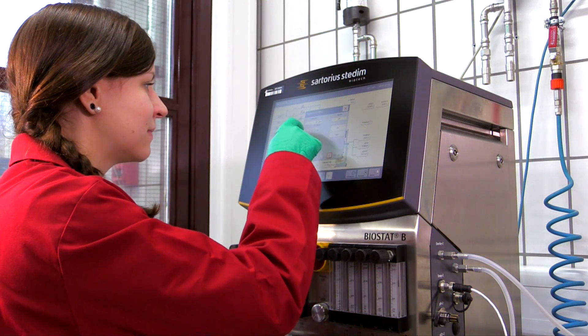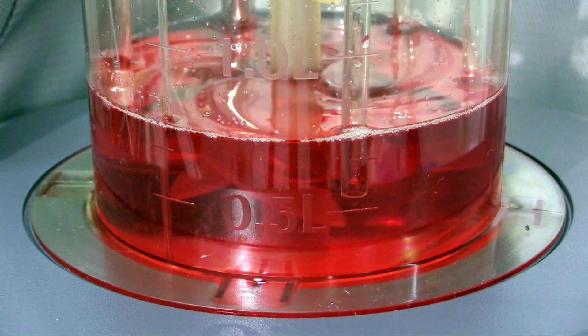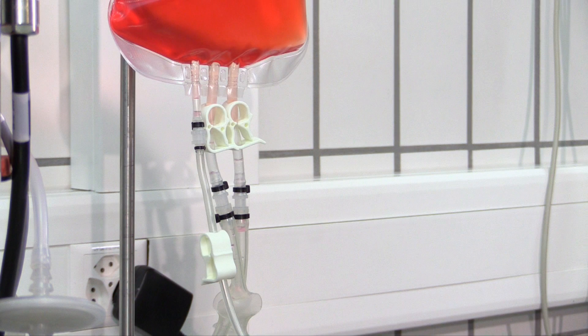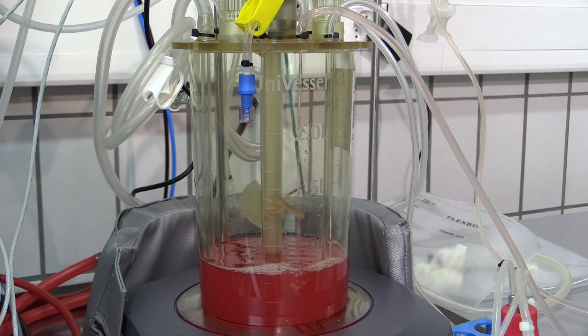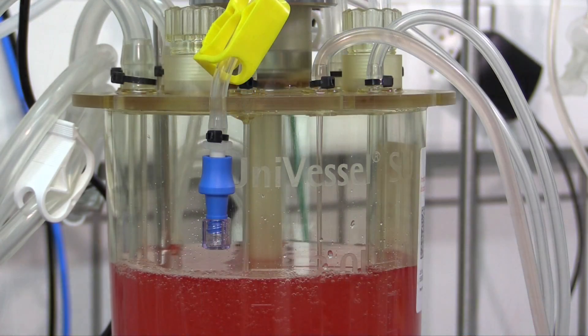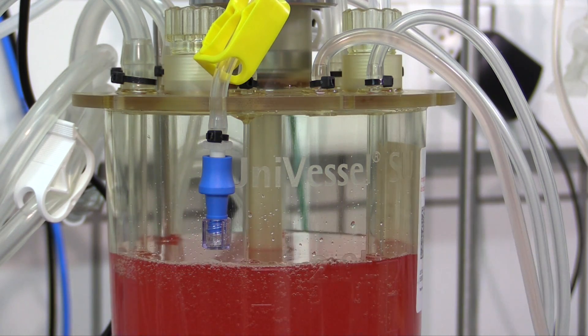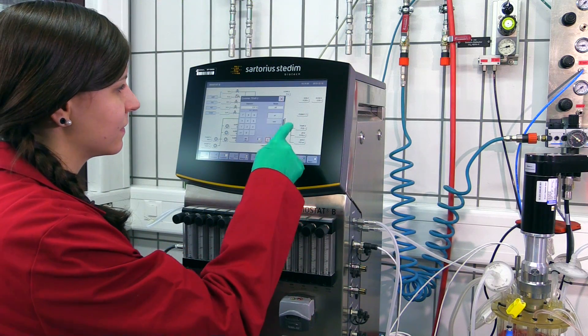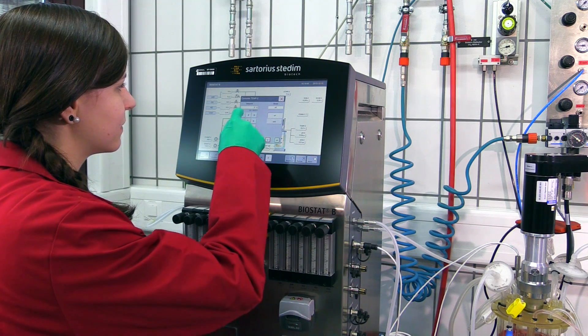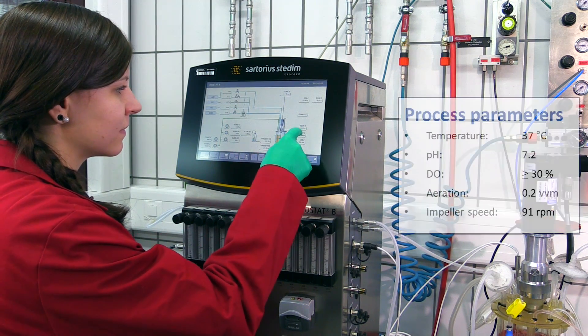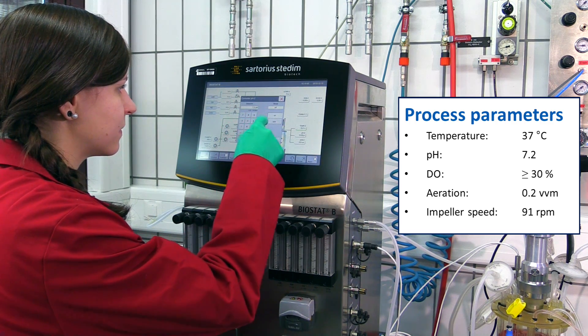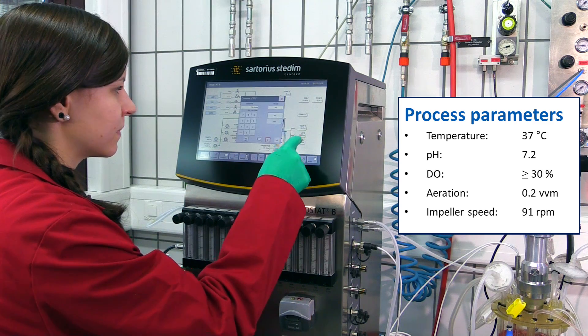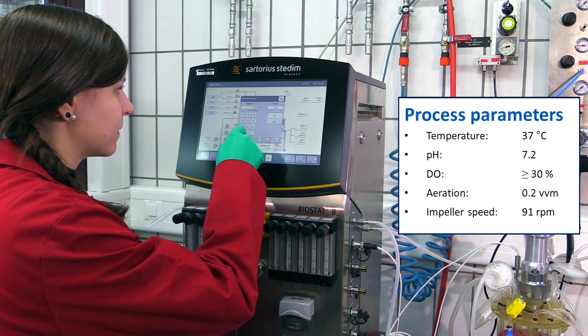After the cell attachment process has finished, continuous agitation at 91 RPM is performed. The medium volume must be increased to a final working volume of 2 liters. The clamp on the medium bag is opened and the medium is transferred to the bioreactor until the 2 liter point is reached. This is the maximum working volume of the Univassel SU. Next, agitation, temperature, pH and dissolved oxygen regulation and headspace aeration are all switched on. The cell expansion process is carried out at 37 degrees Celsius, pH 7.2, dissolved oxygen greater than or equal to 30%, and headspace aeration of 0.2 VVM.